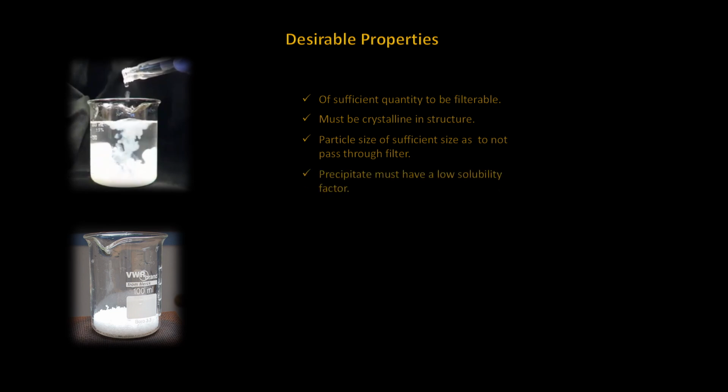Its solubility factor must be very low, or you will end up with product loss, and your analysis will be skewed. The precipitate or product must be pure. If not, the contamination will change the atomic weight of the compound and your final calculations will not be accurate.